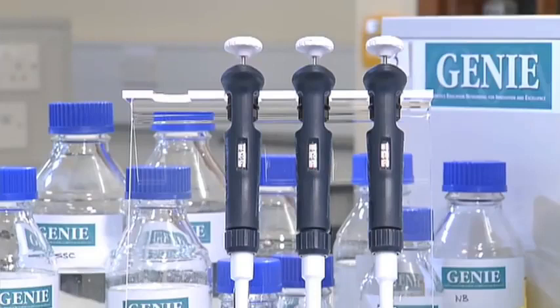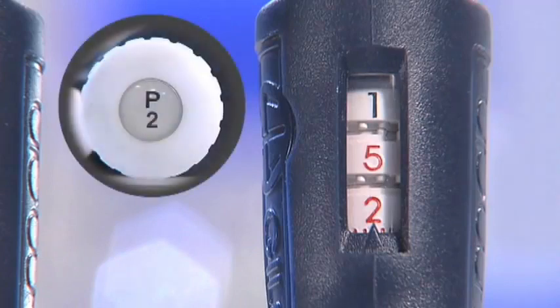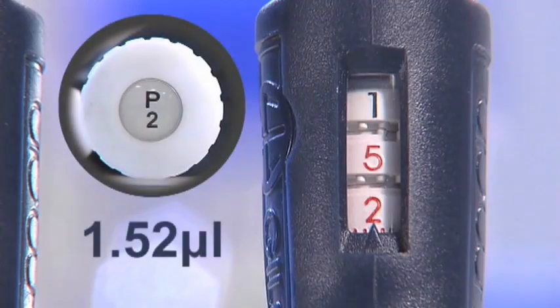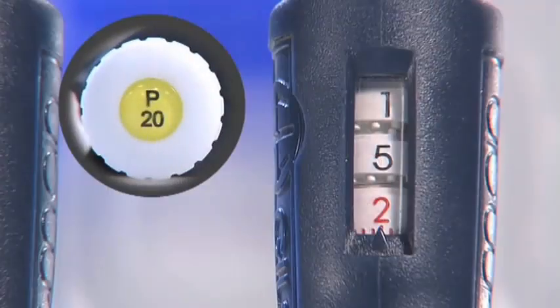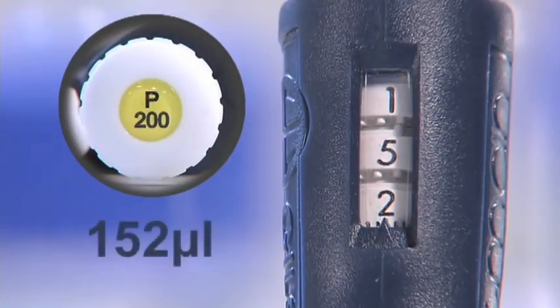For example, these three pipettes have been set to read the same numbers on the dial, 1, 5, 2. For the P2, this means that the pipette is set to a volume of 1.52 microliters. The bottom two dials are in red, indicating 5/10 and 2/100 of a microliter. For the P20, this means that the pipette is set to a volume of 15.2 microliters. The red bottom dial shows 2/10 of a microliter. With the P200, the same visual setting means that the pipette is set to a volume of 152 microliters.